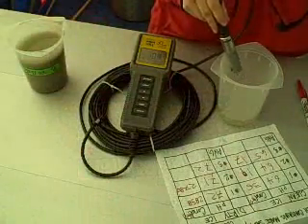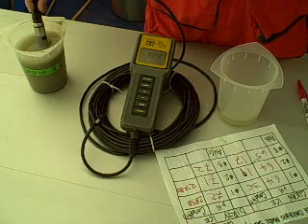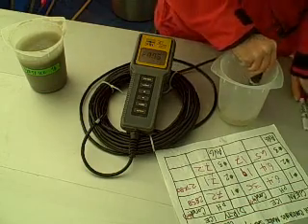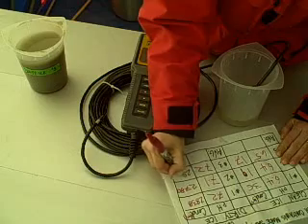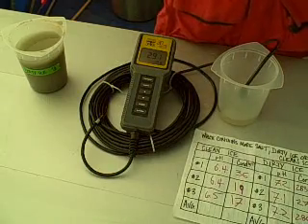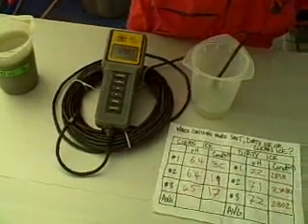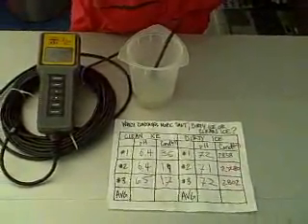And for our last dirty ice conductivity, we'll go with 2,802. So our final conductivity for the dirty ice, we have 2,838, 2,780, and 2,802. Now you take the average.